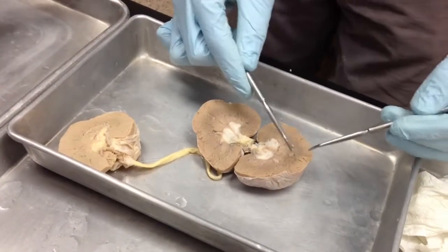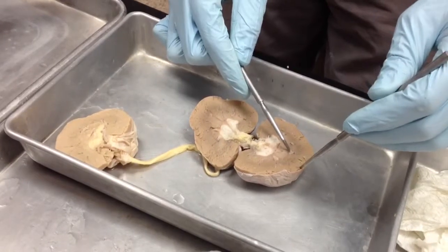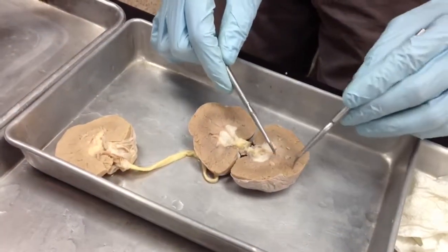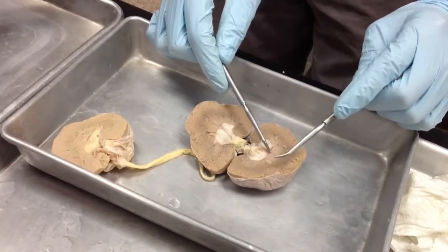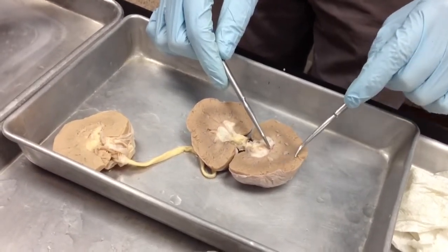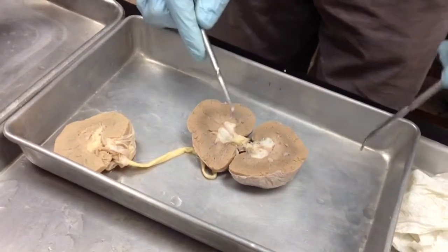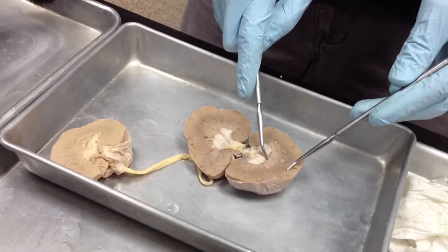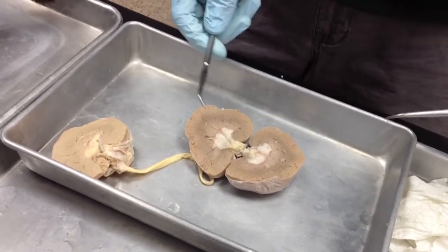One thing to really notice is, if I have a pin very far out there, I'm asking about the cortex. Also, another thing to notice is that differentiation in color. Along that line, you can see how it goes from dark to light. But again, just think about it in three sections: renal pelvis, renal medulla, renal cortex.